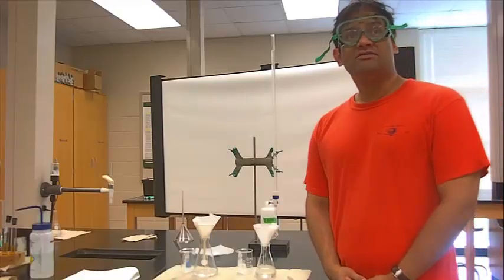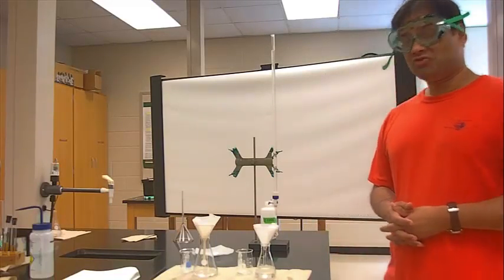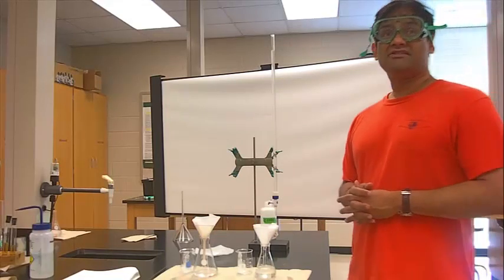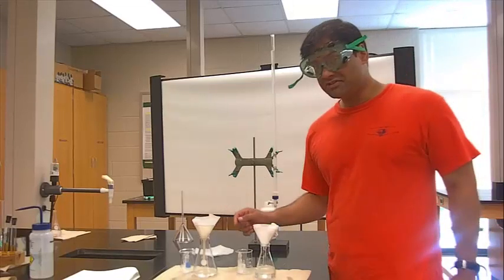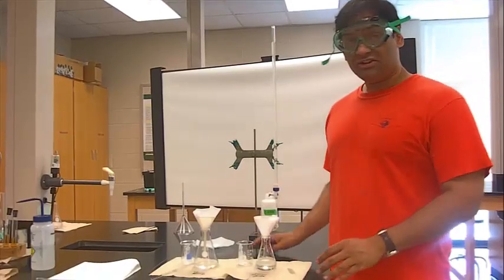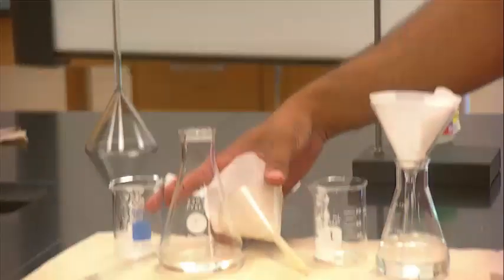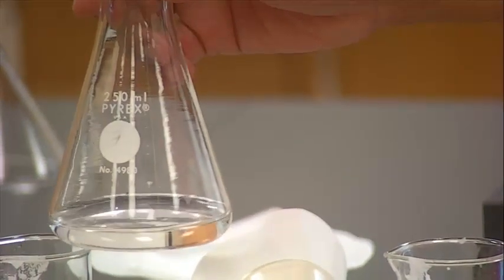So it's important to realize why you are collecting the precipitate in a dry filter paper and dry glassware. Remember, you are measuring the solubility of calcium ion and iodate ion in calcium iodate. And this calcium iodate precipitate that you collected is sparingly soluble. So when you filter it, you not only have your solid calcium iodate shown here, but what is in the filtrate? The filtrate contains your calcium ion and your iodate ion.